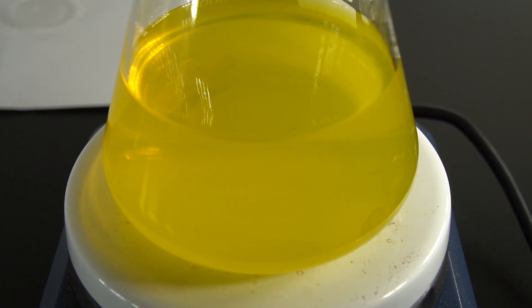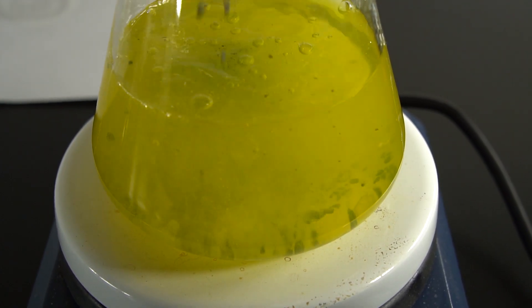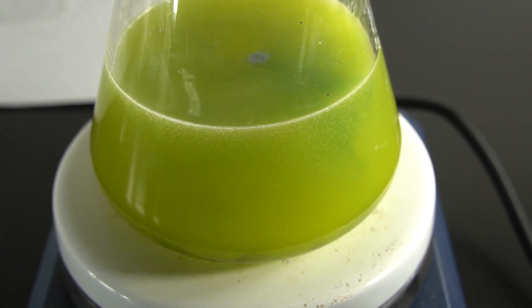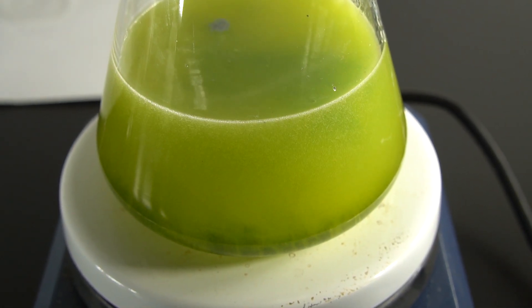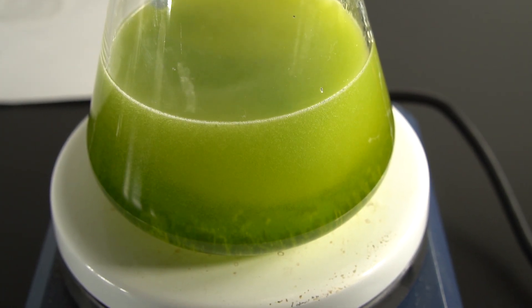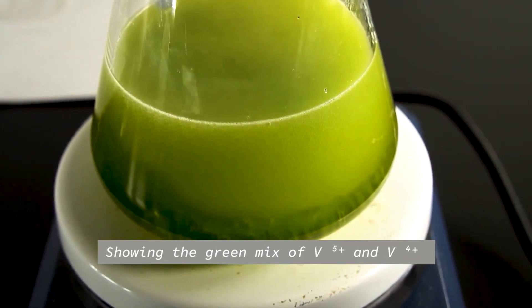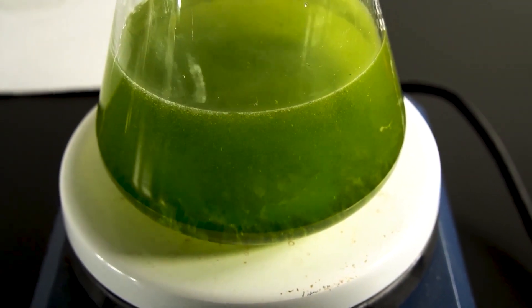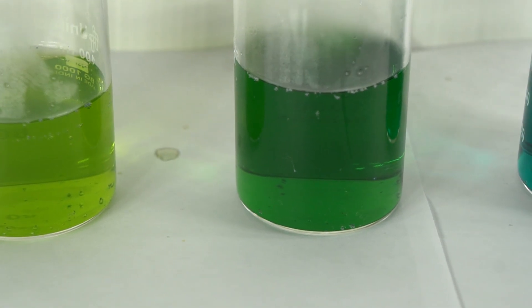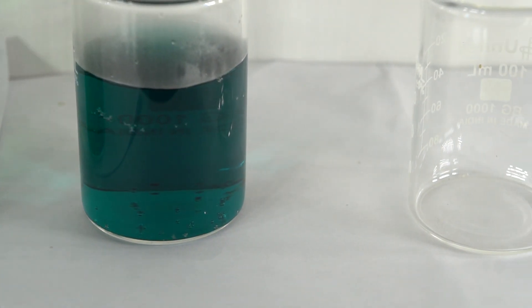Now we're going to add some zinc pellets. This is starting already to quickly reduce the vanadium to the plus 4 oxidation state. You can see the yellow is turning green, and then slowly it's going to turn blue — the zinc as a reducing agent is taking the vanadium from plus 5 to plus 4. Here you can see the intermediate colors and that nice greenish blue color of the plus 4 oxidation state.